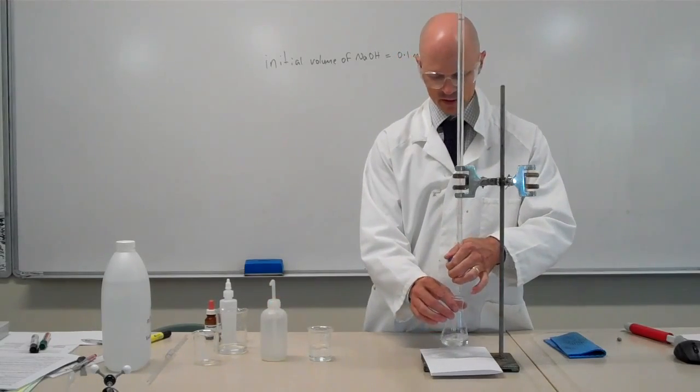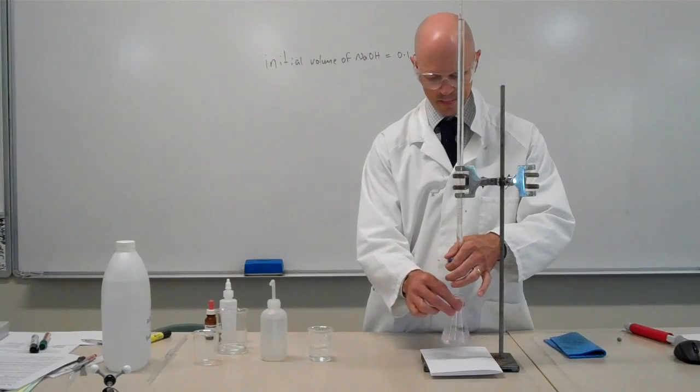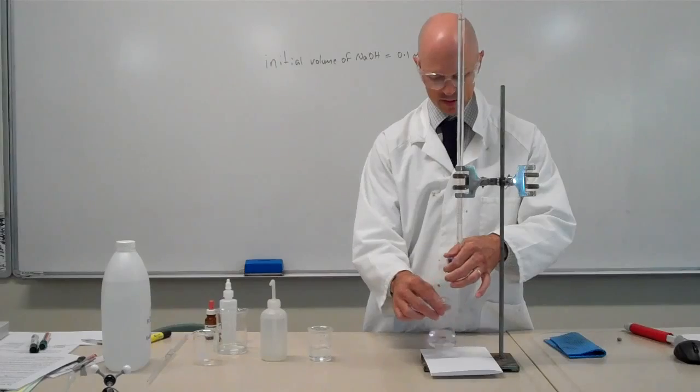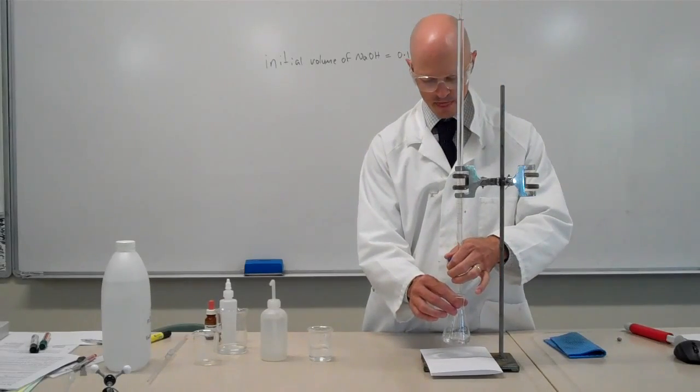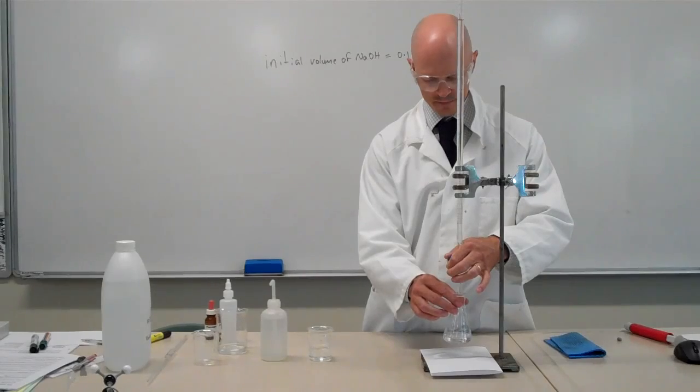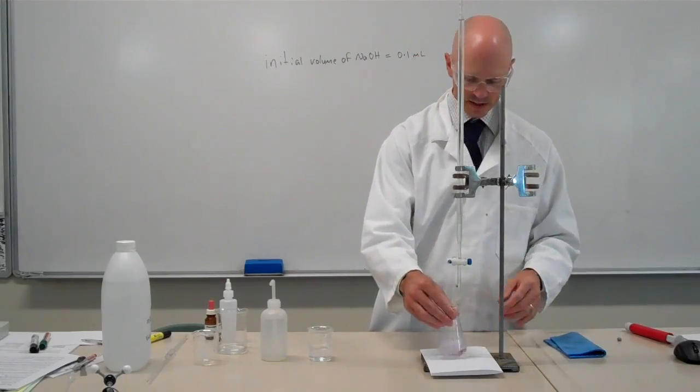Now I was very close then, so I'm just going to add drop by drop. It's really in between. It's very, very close, until I get a permanent colour change.